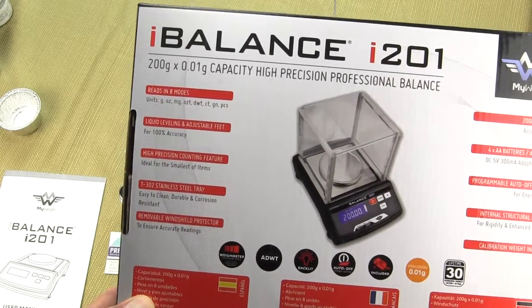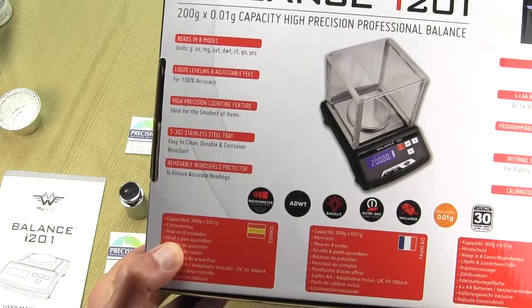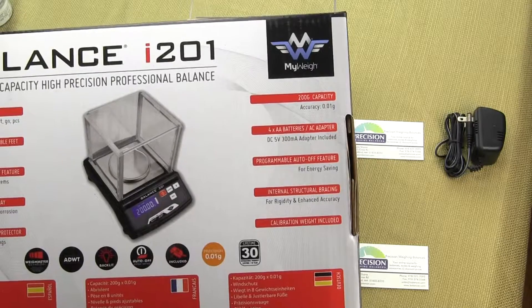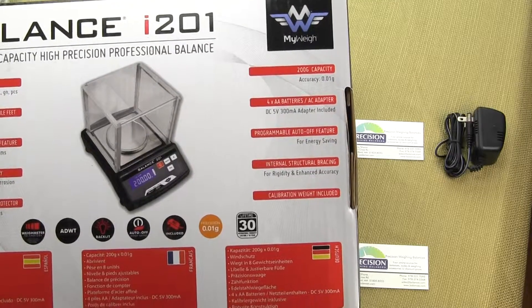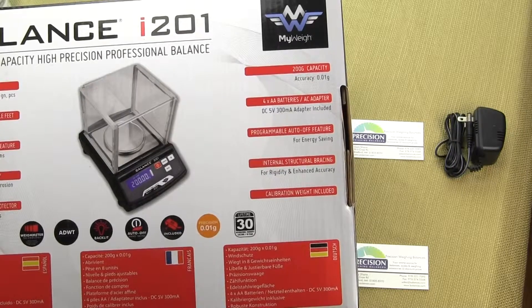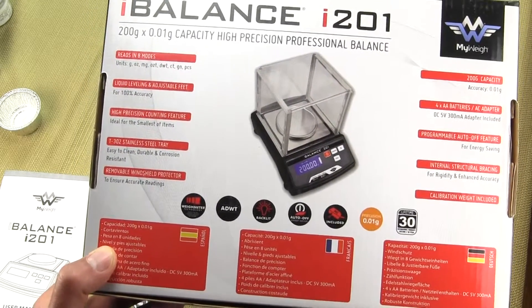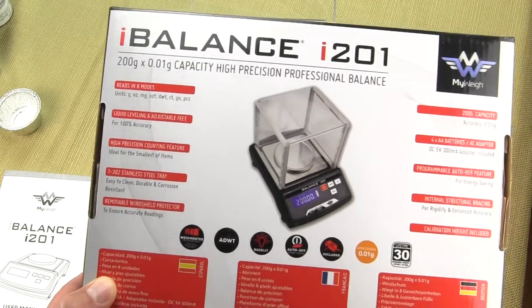It mentions the weigh units available, how it has leveling feet so you can adjust the balance. It has parts counting, a 302 stainless steel tray, and a 200 gram calibration weight which is included. It runs off four AA batteries and has a programmable auto shutoff feature. MyWay does a great job in packaging versus competitive brands — most balances just come in a plain brown cardboard box without highlighting any features.